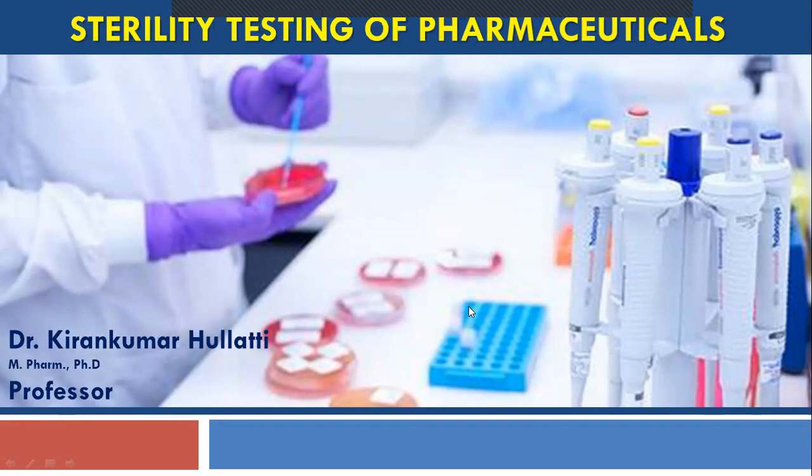but it is not as easy as it looks, because during the sterility testing, we do not test the whole sample for sterility. For any quality assurance or quality control purpose, we do not take all units for the testing. Suppose you have manufactured around 10,000 vials, it is not possible to test all the 10,000 vials.